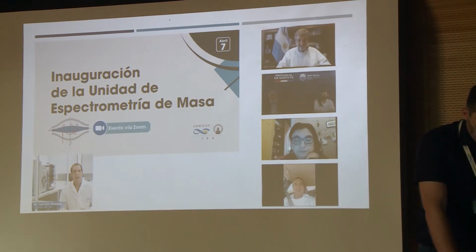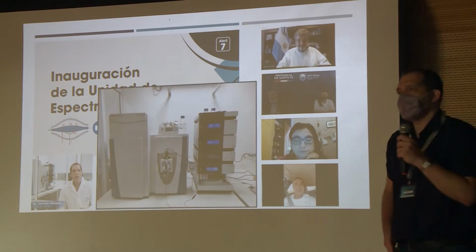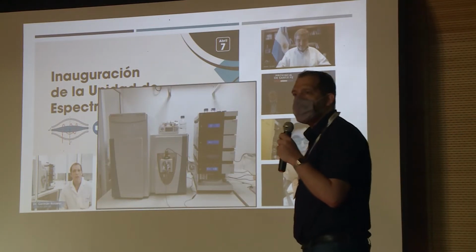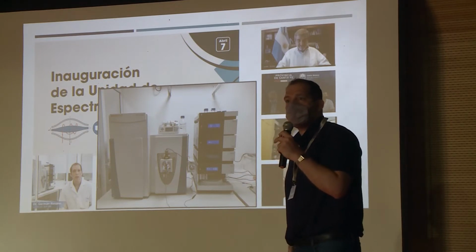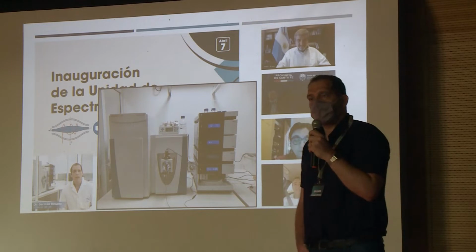And what were we opening? Well, the star of the inauguration and the mass spectrometry unit, of course, is the mass spectrometer, a Q Exactive HF with Orbitrap technology.